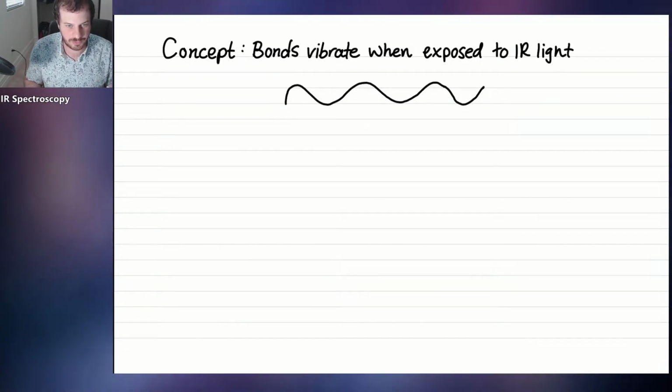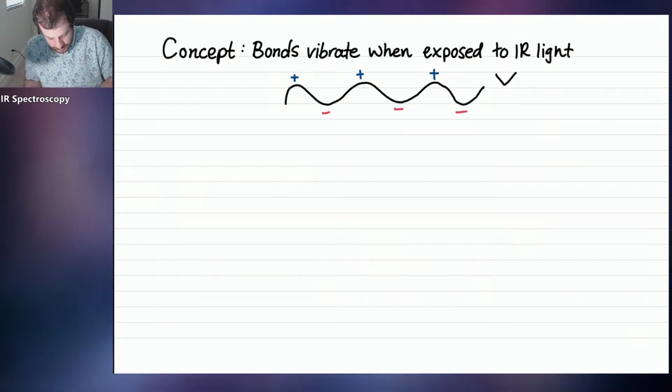So let's just say for a second we're looking at only the electric component of this wave. As it oscillates, you have areas with positive charge and areas with negative charge. So the wave is oscillating through space, positive, negative. That is what light is. It's this positive, negative electric field. And let's say this light navigating through the universe strikes a molecule like this, for example, acetone.